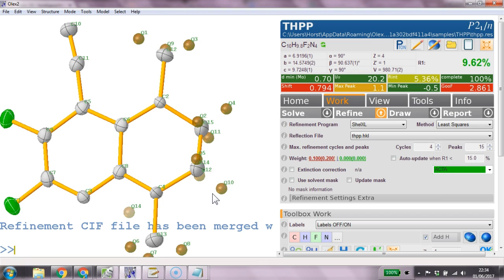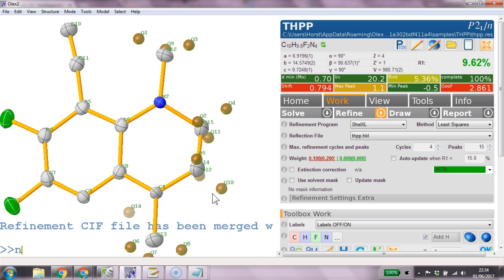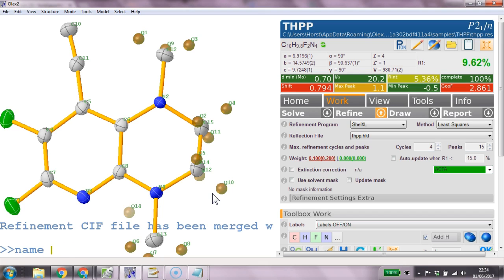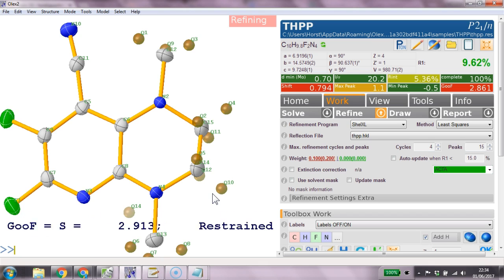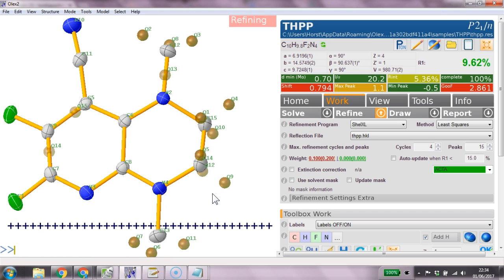Z2. Name c 2 and not an f but an n. Name c 4 n. Name c 3. It's also nitrogen and c 10 n. It's almost faster typing than using the up key on this one.